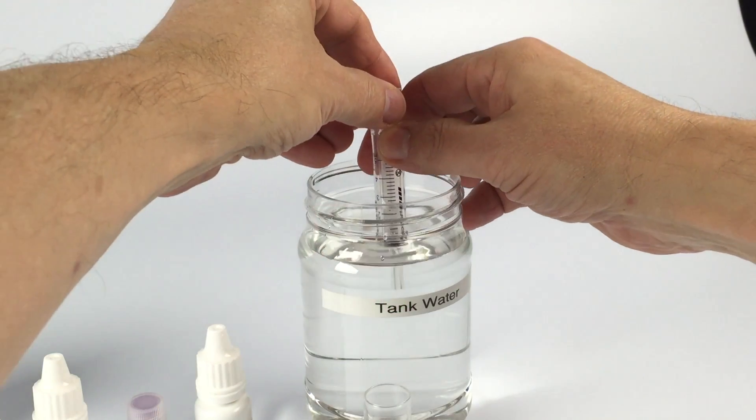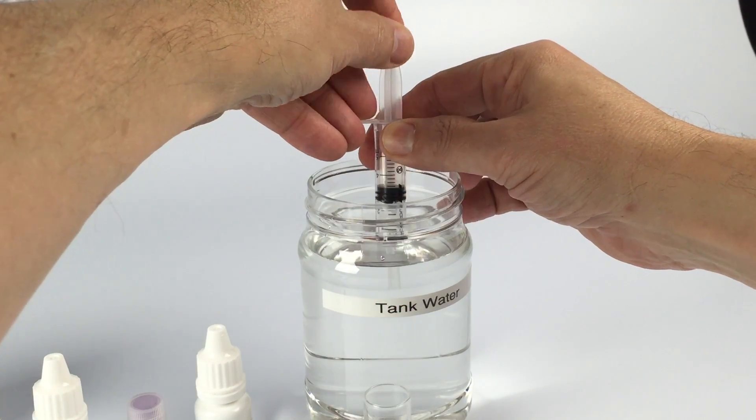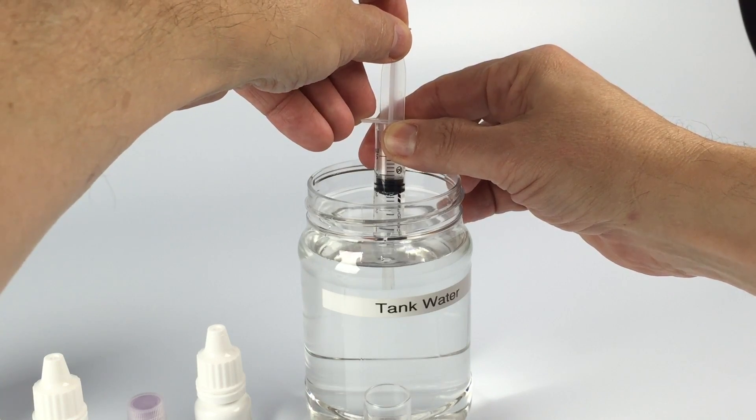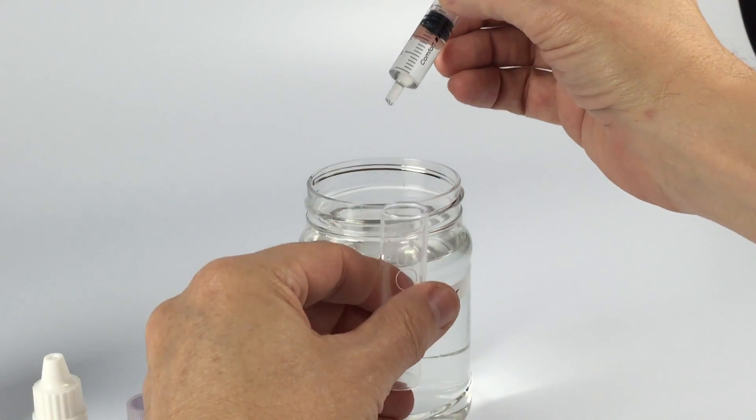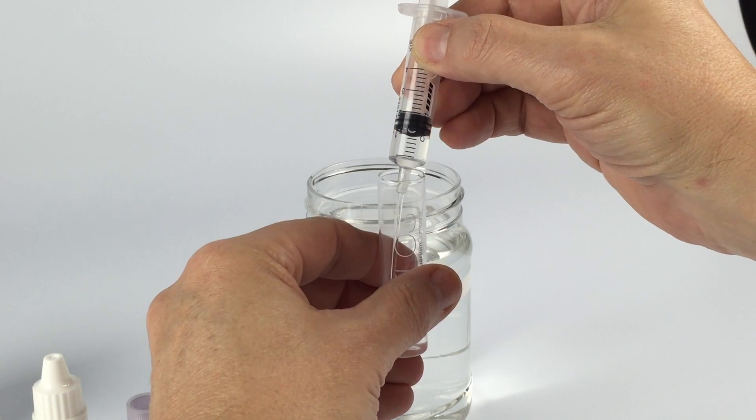You need exactly 3 milliliters of tank water for this test and this is the first stage. Push out all the air from your syringe, then draw up 3 milliliters and add that to the test vial.